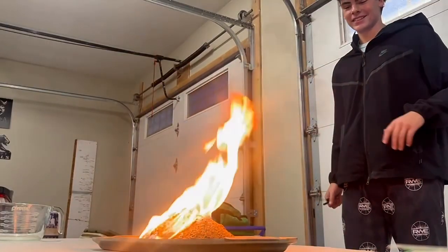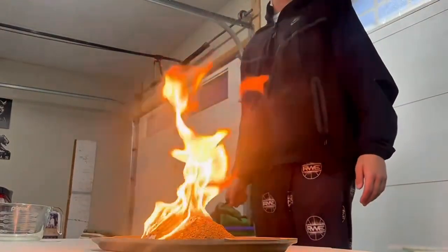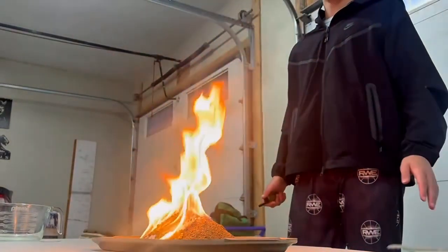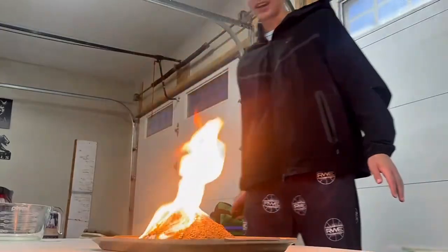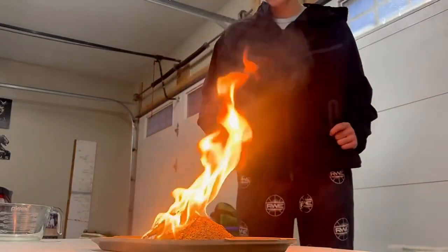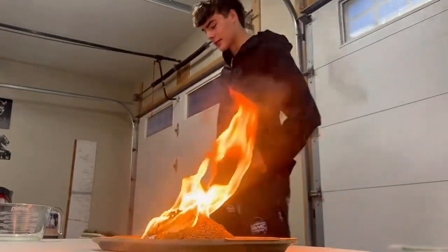This is kind of crazy. Good thing there's no smoke alarms underneath this. I don't know how I'm gonna put that out. We'll just let it do its thing. Let's get a close up for this though.